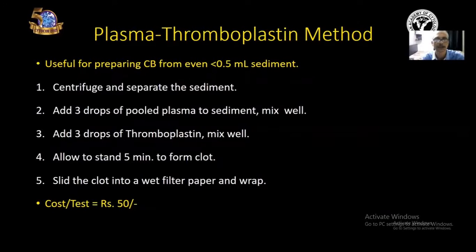The first step is centrifuge and separate the sediment from the fluid. Then add 3 drops of pooled plasma to the sediment and mix well.